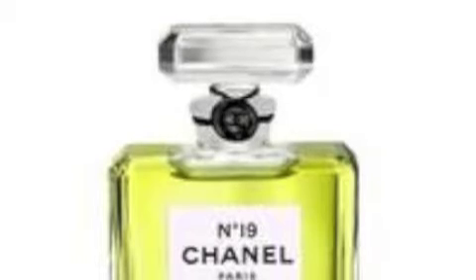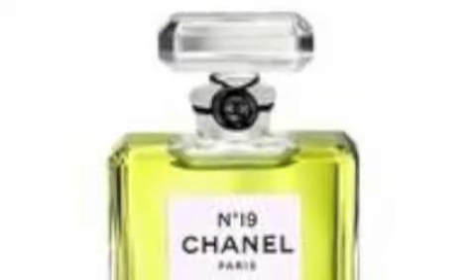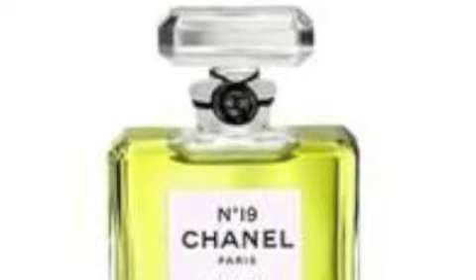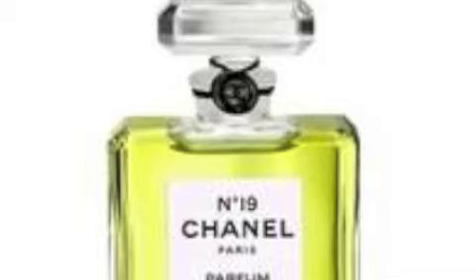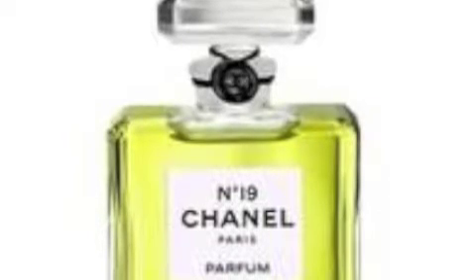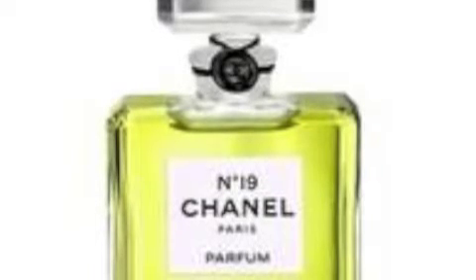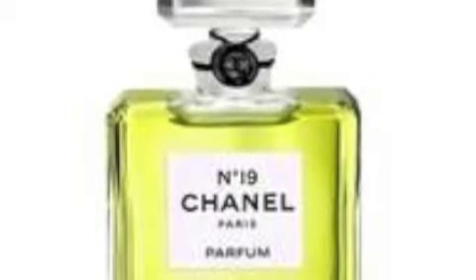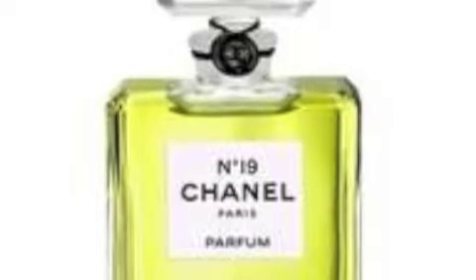So our lab focused more on organic chemistry, specifically esters. Esters are produced in a reaction between a carboxylic acid and an alcohol, in a reaction known as esterification. Esters are known for their pleasant fragrance. Since we have access to a huge variety of acids and alcohols, we can have esters that produce different scents. Sometimes only small changes are needed to get a completely different fragrance.